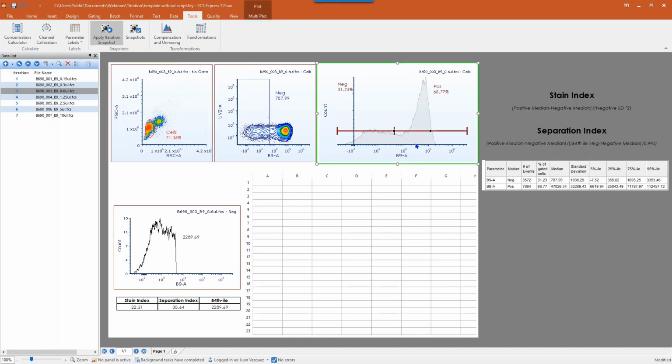Okay, and don't worry about how we got here. And in a second, once we actually go through this, I'll show you how we can actually create this on a blank layout and how we can start from scratch if this is something that you want to do, rather than the group specific type analysis.